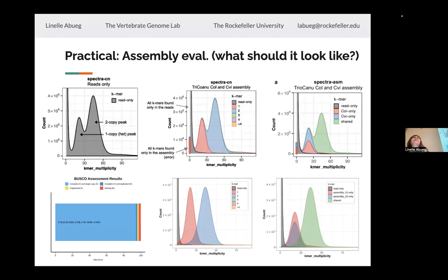Yeah, I just realized that we are doing all the QC on the contigs and not the scaffolds. We're going to do another round of QC once we get to the scaffolds. The Merqury we don't do again because stuff usually doesn't change that much, but BUSCO might change, and a lot of it's mostly just the assembly stats that will be changing. So we'll run some of them after we finish scaffolding with BioNano and Hi-C.